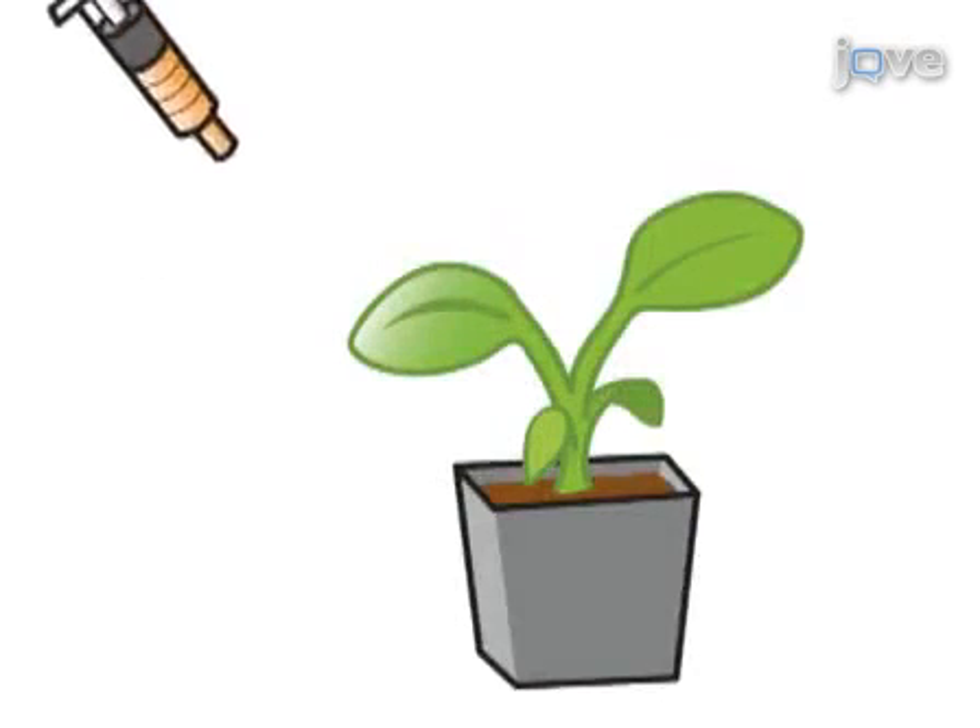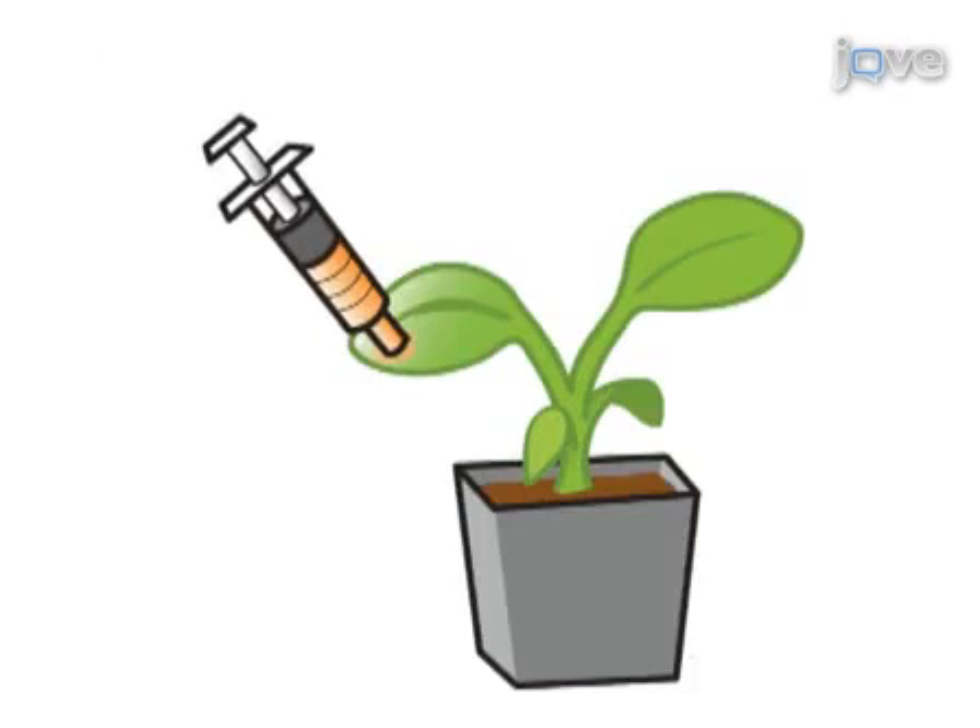The bacterial mixture is then infiltrated into Nicotiana benthamiana or tomato seedlings using a needleless syringe.